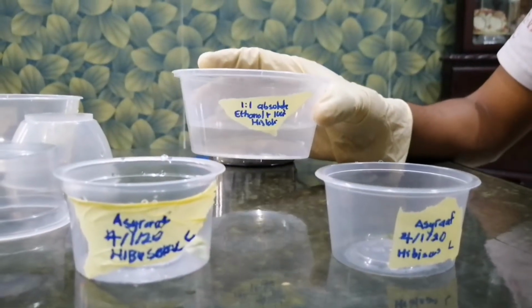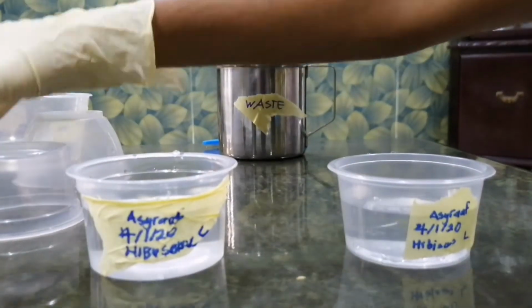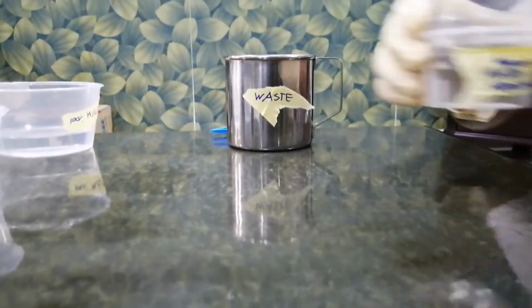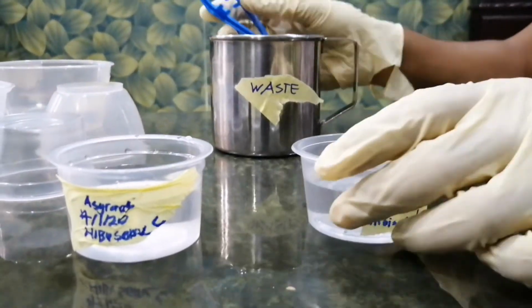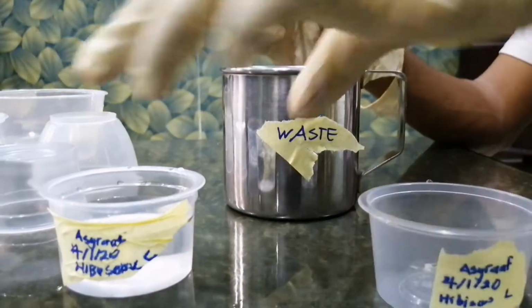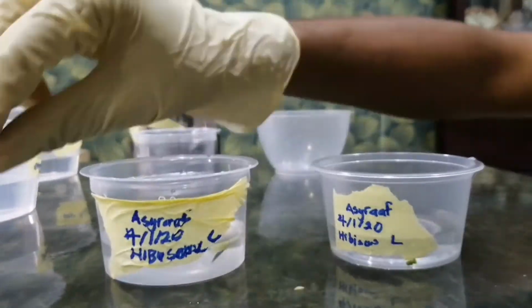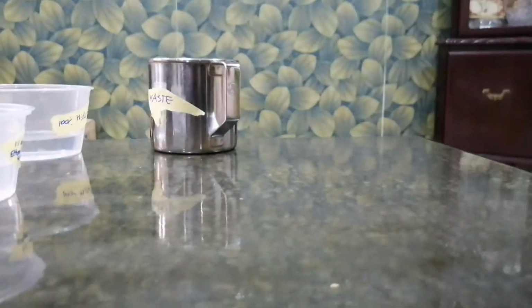For the second part of the clearing process, add a 1:1 ratio of absolute ethanol and 100% volume over volume Histoclear and incubate it for 30 minutes at room temperature. After that, the 1:1 solution is removed. A 1:3 ratio of the clearing solution is added and is also incubated for 30 minutes at room temperature.